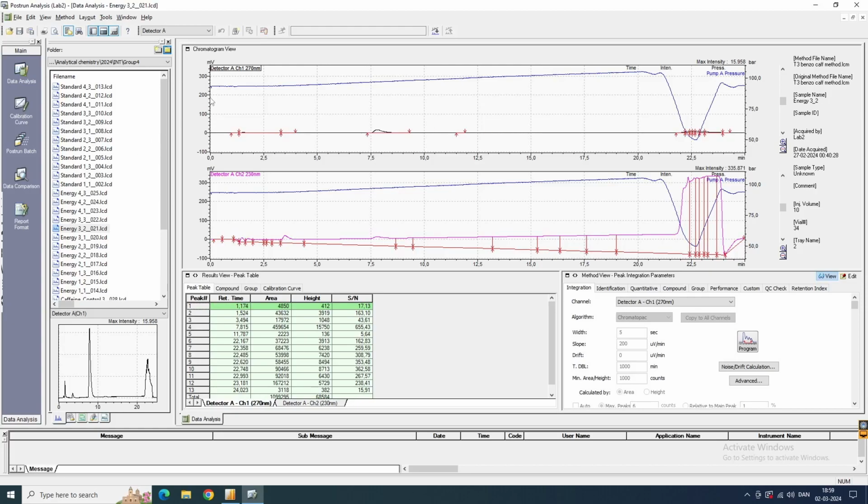All right, let's do a quick and dirty data analysis of HPLC software. As you can see, I've already logged in and opened up the post-run analysis software on our HPLC system. And I'm going to use one of the international group's data as an example.